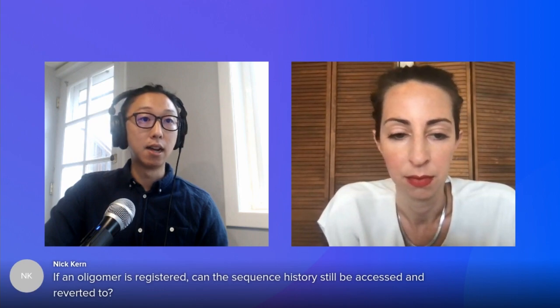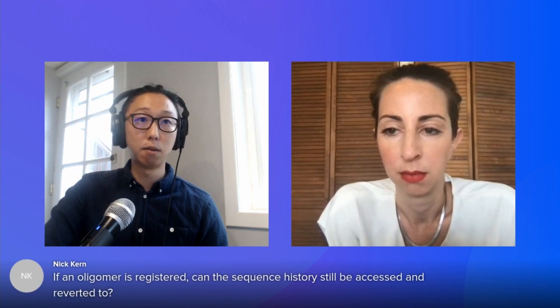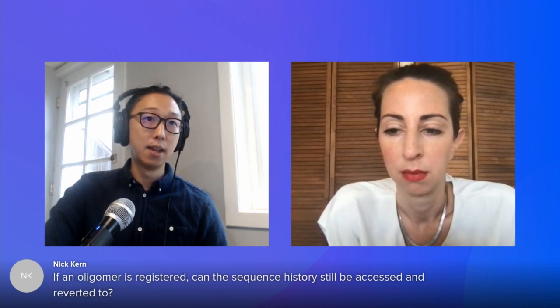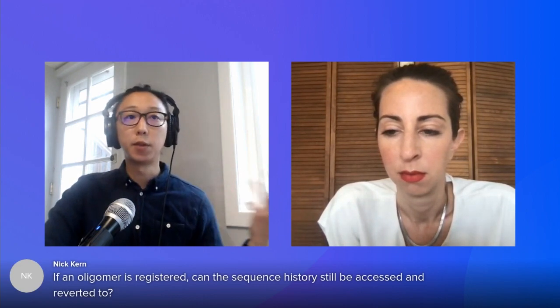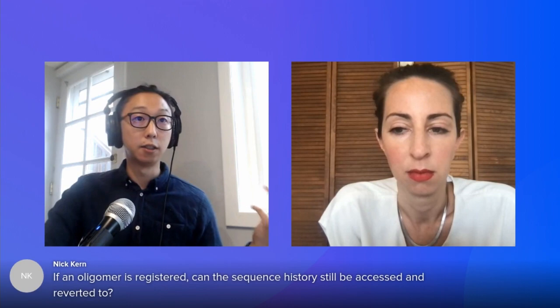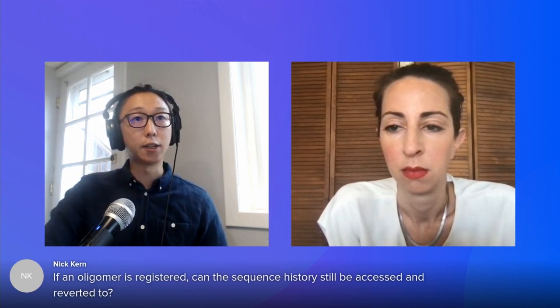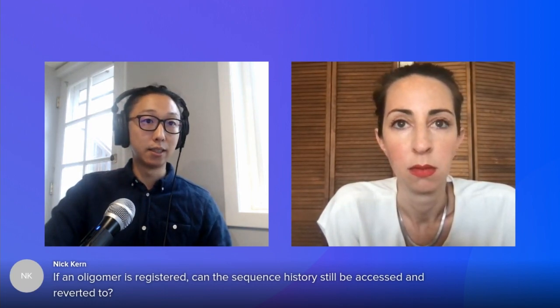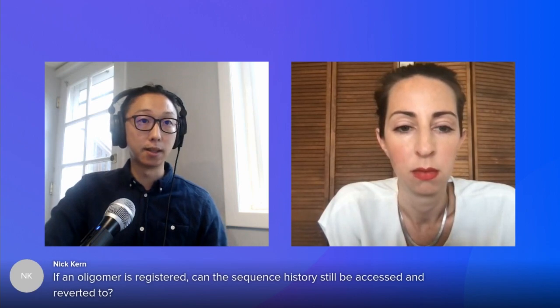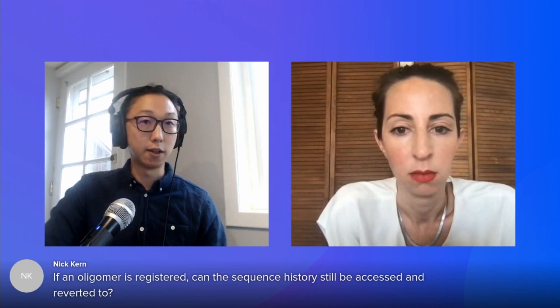Yes, absolutely. It doesn't matter if an entity is registered or unregistered. That entity and all data associated to it, regardless of if it's associated results data or analytical data, or it is actual sequence history data, all of that continues to persist with that same oligo entity, regardless of its registration status. And so that kind of gets back to an earlier comment about preserving data integrity, right?